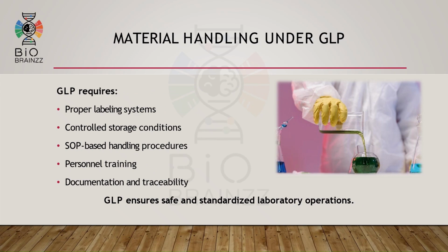Good laboratory practices, or GLP, play a major role in safe laboratory operations. GLP requires proper labeling systems, controlled storage conditions, SOP-based handling procedures, regular personnel training, and complete documentation. Maintaining proper records and traceability ensures quality, consistency, and regulatory compliance in laboratories.